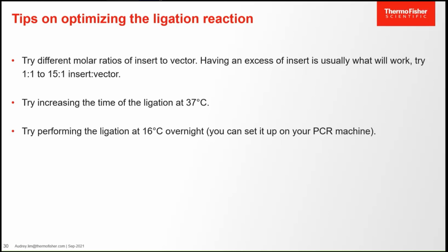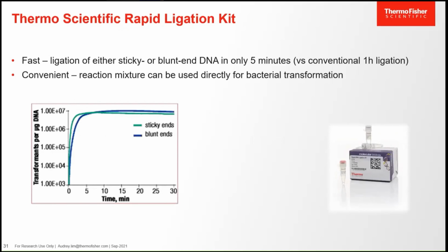Most conventional ligations can be completed in 1 hour, but sometimes increasing the ligation time can also help. So you can also try to perform the ligation at 16 degrees Celsius overnight. As I mentioned just now, conventional ligation usually takes at least 1 hour to complete, or overnight. You can actually use the Thermo Scientific Rapid DNA Ligation Kit.